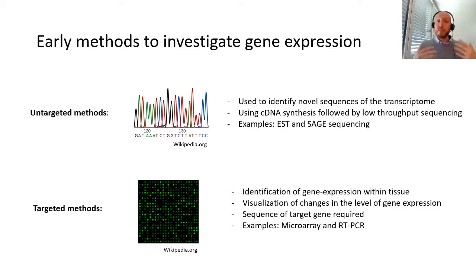And even though this is a very similar approach to what is done in RNA-seq today, the biggest limitation of this technology was that sequencing prior to NGS was super slow and super expensive. And of course, the genome annotations were suboptimal. So this technology had some major challenges that it needed to overcome.